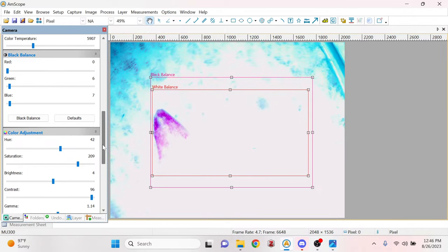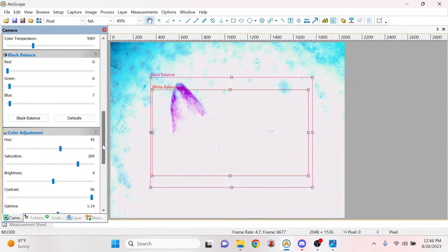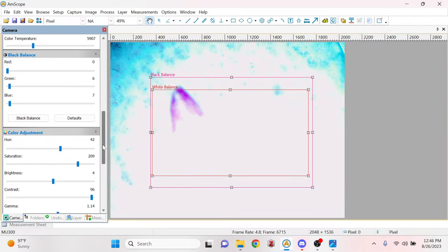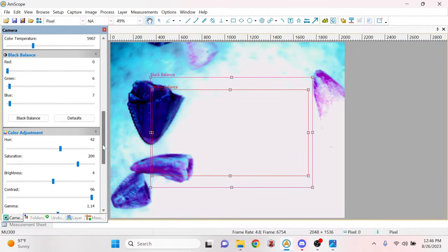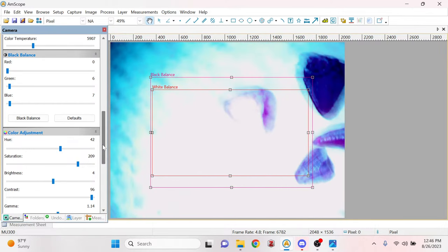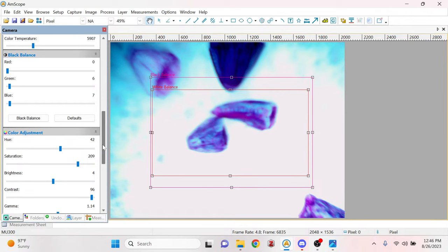So this tooth I'm trying to focus on is white in coloration except for the tip, and the bloom is such that I just can't get it, it's just so washed out. I haven't used this microscope super intensely since I did my university job with it back during the pandemic. So partly I'm just reacclimating myself to how all this stuff works. That tooth in the center there, I think, let's see. Let's take a closer look.